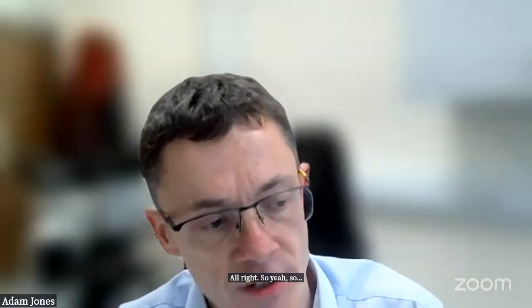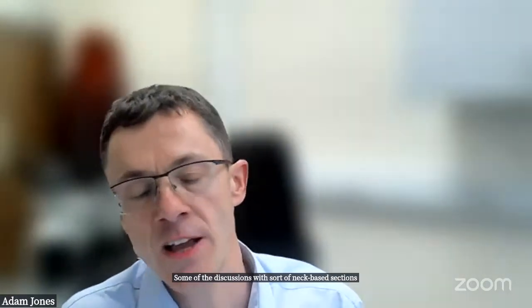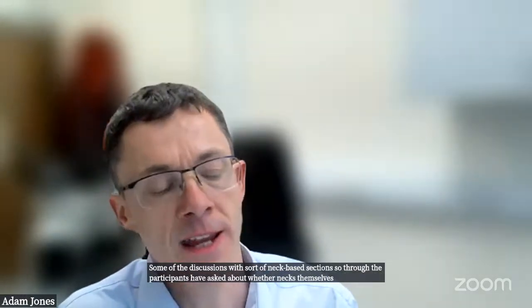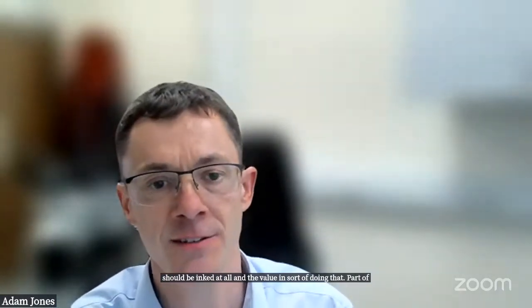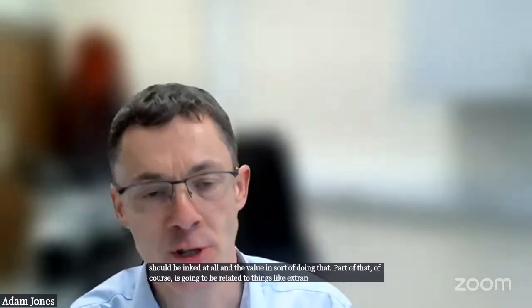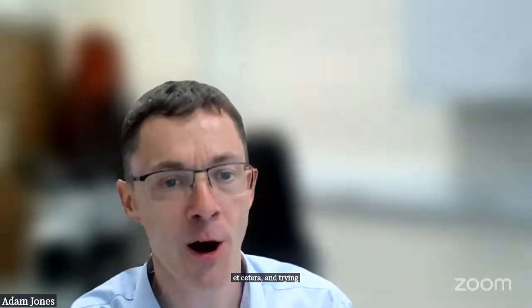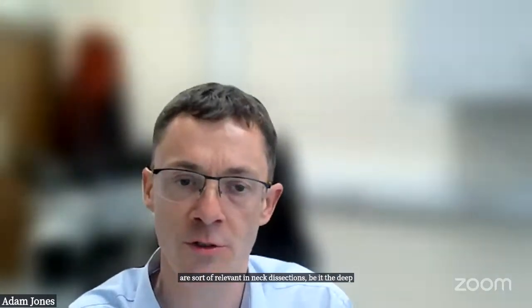So there's some of the discussions with neck dissections. A few of the participants have asked about whether necks themselves should be inked at all, and the value in doing that. Part of that, of course, is going to be related to things like extranodal extension, etc., and trying to determine whether margins are relevant in neck dissections, be it the deep or the superficial.